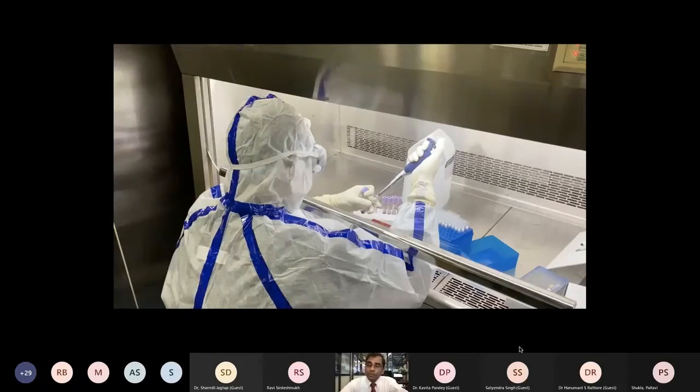So that's where I think we can take a pause and think about some possibilities, some alternate ways. For instance, if you are looking at some very specific regions of the protein which are low abundant, you can just run them on SDS-PAGE, excise that region from the gel, do the in-gel digestion of those pieces of the gel, and use that information for your plasma proteomics. Or let's say you are keen on looking at some specific peptides, and you don't want to perform global proteomics or discovery proteomics.